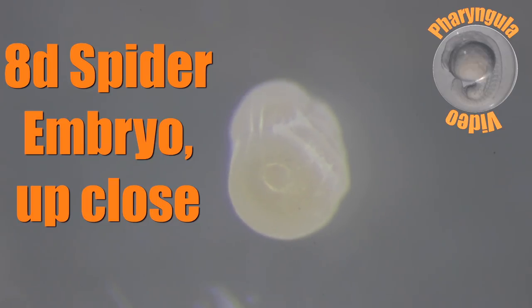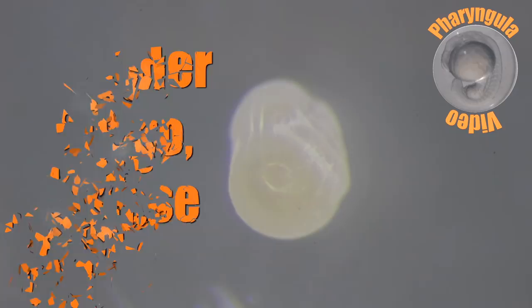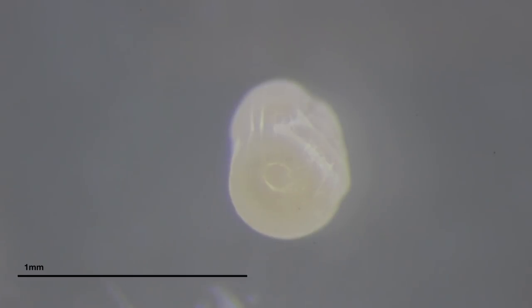And you can sort of see it's an incipient spider at this point. So it's no longer just a featureless ball. You can actually see hints of the pedipalps. You can see the legs forming along the side.